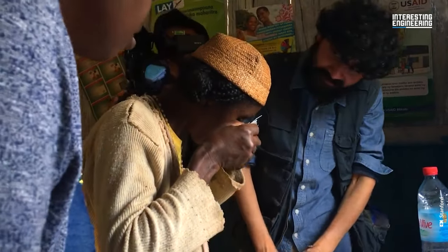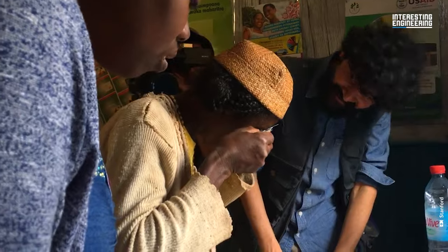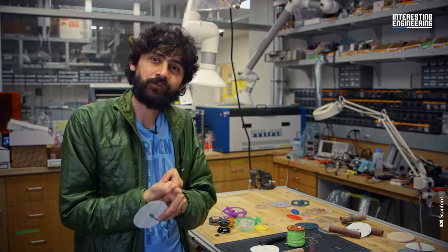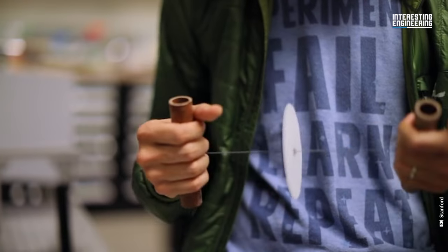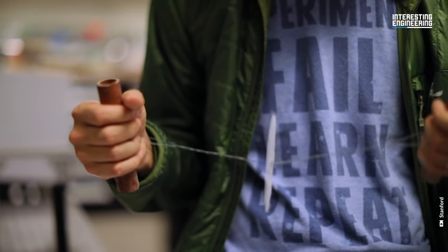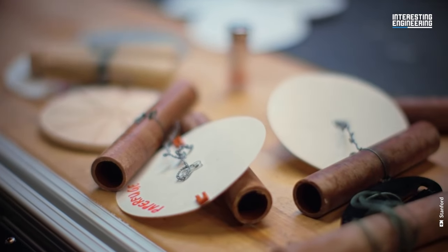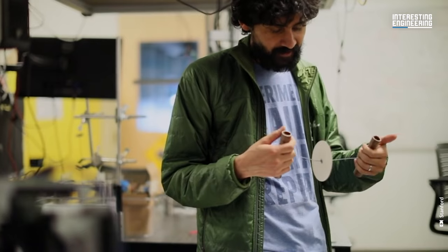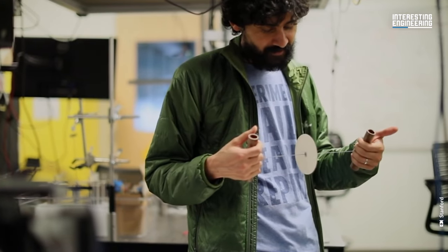Team leader Manu Prakash and his colleague brainstormed and prototyped for two weeks. Then they decided to mount a capillary of blood on a whirligig toy that had a paper disc attached to it, and they successfully centrifuged blood into layers. It was a definitive proof of concept.